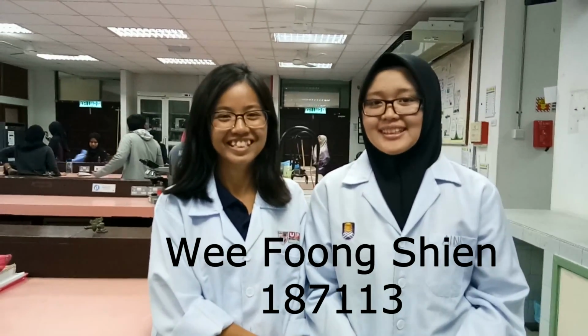Good evening. Today we are going to conduct experiment 5, which is observation of the digestive system.